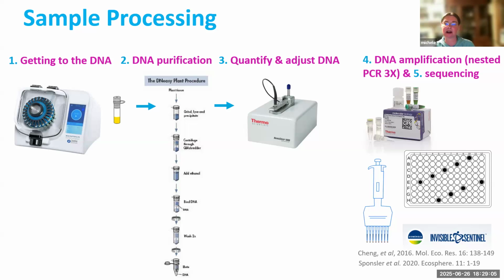And then the last steps are what I call the techie geek side of it. So we use a process called PCR. You may be familiar with this if you got a COVID test and it was a PCR COVID test. PCR is essentially taking a target piece of DNA that you're interested in. In our case, I'm interested in ribosomal DNA because that's what I use to identify the plant. Taking that piece of DNA and photocopying it millions and bazillions of times.